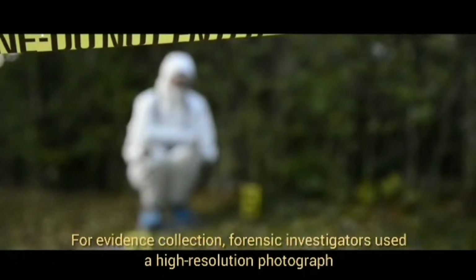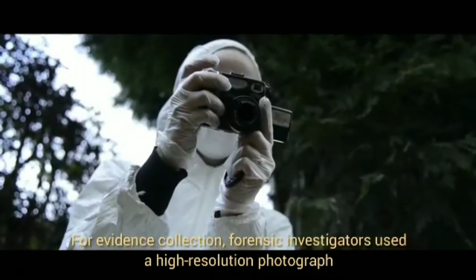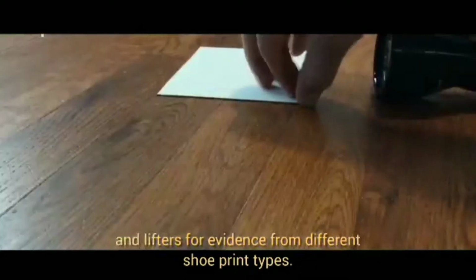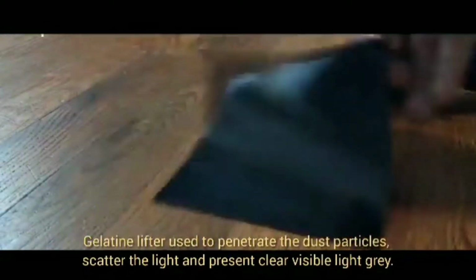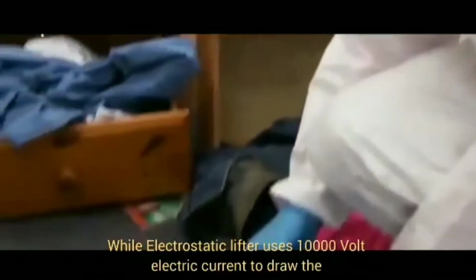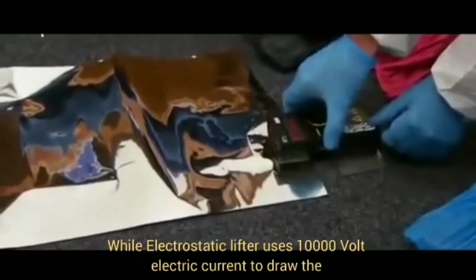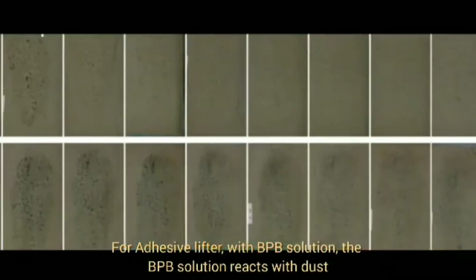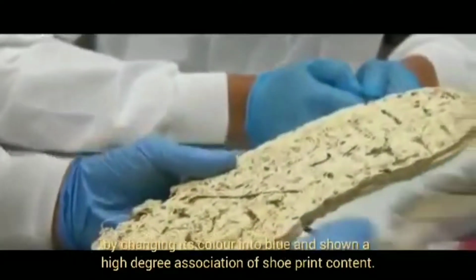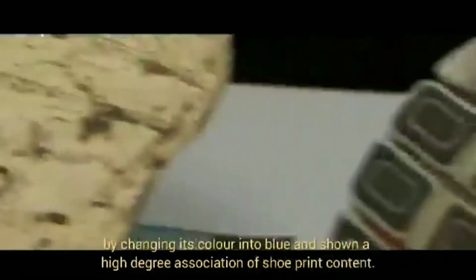For evidence collection, forensic investigators use high-resolution photography and lifters for the different shoe print types. A gelatin lifter penetrates the dust particles, scatters the light, and presents a clear, visible light gray print, while an electrostatic lifter uses a 10,000 volt electric current to draw the dust particles to the film when electrostatic adhesion is created. An adhesive lifter with BPB solution reacts with dust by changing its color to blue and shows a high degree of association with the shoe print content.